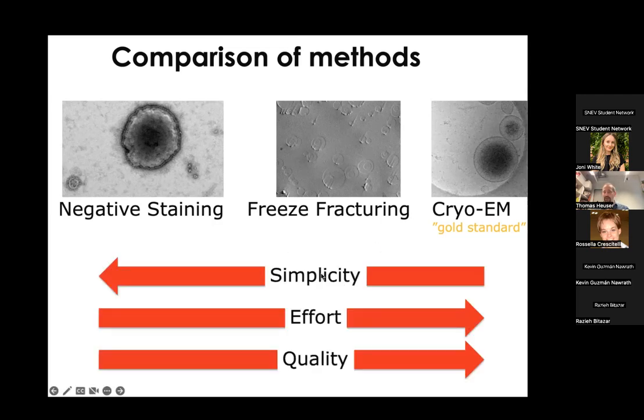If we want to rank them in terms of how much work it is to get such an image, for negative stain we're looking at a few minutes. For cryo-EM, depending on how you're set up, it's definitely hours or maybe even days of work. It's also way more expensive, way more effort, and you need more specialized equipment. But we also see a strong increase in quality going from conventional methods via hybrid methods to cryo-EM methods.